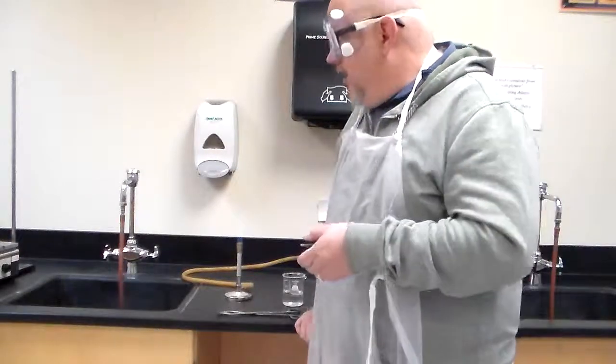Now, if you noticed, there seemed to be a slight difference in the coloring that was there. You saw two versions of orange, didn't you? You should. Now, with the lab being dark, where the lights are turned off, you should be seeing a whole lot more.